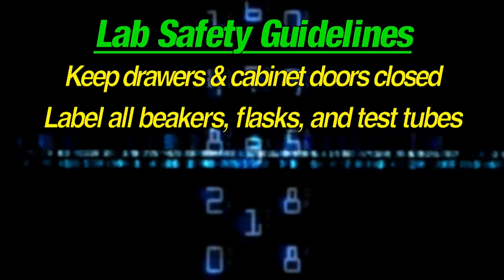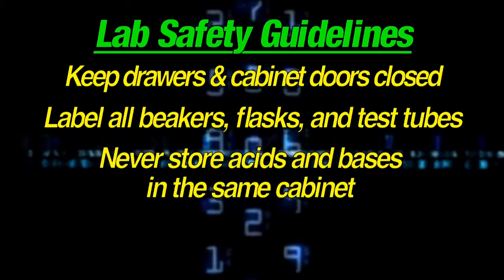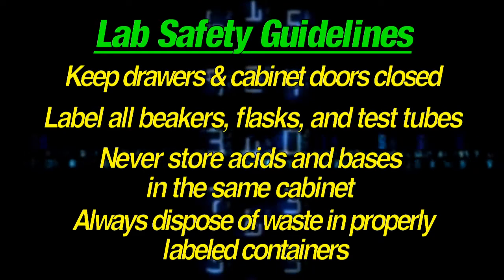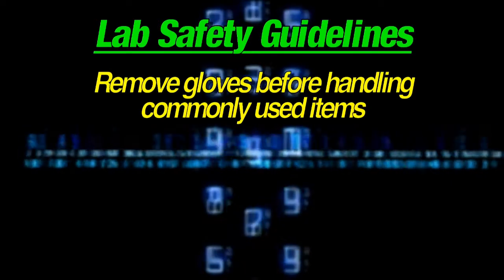Keep drawers and cabinet doors closed. Label all beakers, flasks, and test tubes with their contents. Never store acids and bases in the same cabinet. Always dispose of waste in properly labeled containers. Remove gloves before handling items such as telephones, doorknobs, or computers.